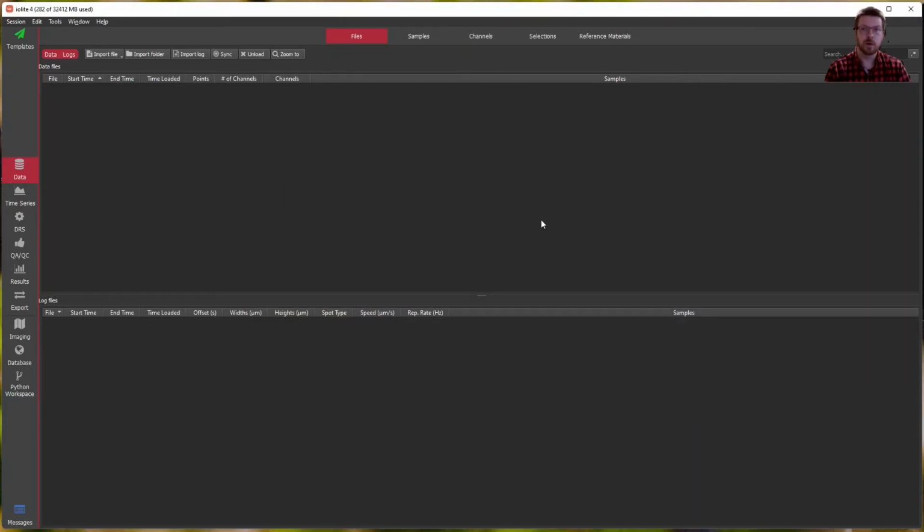We do also provide a way in the user interface to create a new plugin via some built-in templates. These can be helpful because they already have the required functions defined with ample comments and only require you to modify the implementation as you see fit.